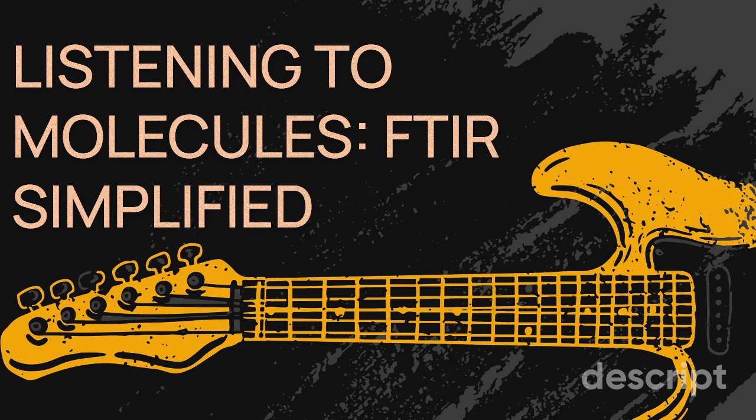What about drug development? Could FTIR play a role in designing new and more effective medicines? Absolutely. One of the biggest challenges in drug development is understanding how drugs interact with their target proteins. Right. FTIR can provide crucial insights into these interactions, allowing us to see at a molecular level how a drug binds to a protein and triggers a specific response. So it's like having a front row seat to the molecular drama unfolding within our cells. Precisely, and that knowledge is invaluable for optimizing drug design. We can use FTIR to screen potential drug candidates, identify the most promising leads, and even guide the design of more targeted and effective therapies.